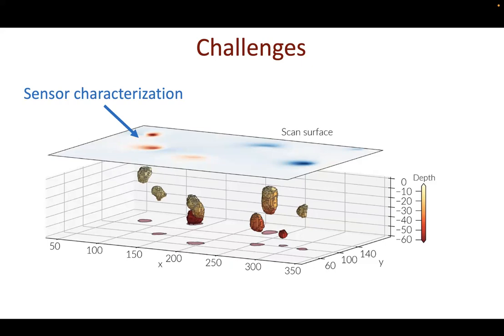But if you consider them to be point sources, then your whole geometry changes, because the sample sensor distance is only a couple of micron, your grains are a couple of micron, and your sensor size, your pixel size, is like 1 by 1 micron. So they're all in the same range of sizes. So you cannot just make your pixels into a point source.